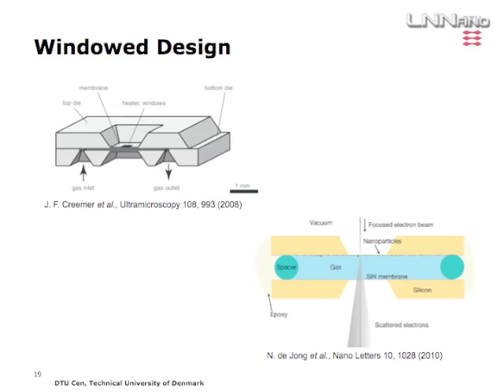Of course, there's also the other way of doing it, which is the window design. This has many advantages and a few drawbacks as well. In the window design, you have a tiny gap surrounded by electron transparent windows, which may be easier to see on the other slide here. There's a few 100 microns here. You have spacers, so you can have your samples sitting inside here. And in this kind of setup, they have actually demonstrated up to atmospheric pressure within a TEM.